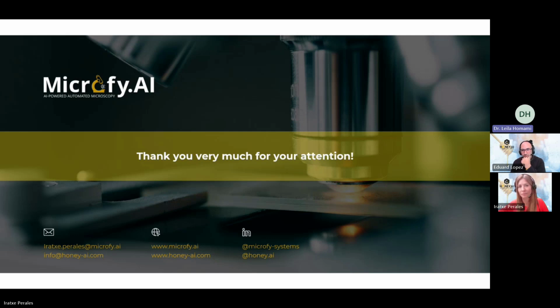Thanks for your answer. I have also another question. If your database is not yet global, how do you manage? For example, if we have acacia honey from China, how do you indicate it? Because your data set is basically from Europe. First of all, if it is a mixture of European honey with Chinese honey, how do you indicate it? Or even if it's only from China, because your database is at the moment basically European. How do you indicate it, and how do you inform your customers?